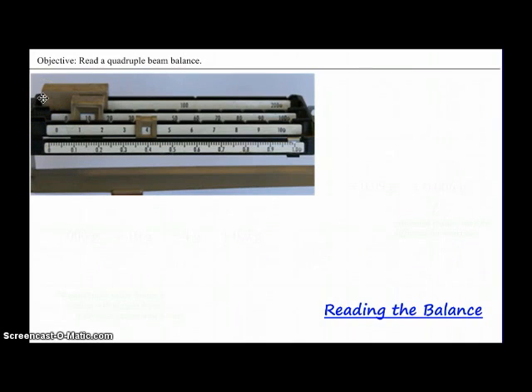When we take a look at the beam farthest away from us, that's where we're going to start. And we can see that our rider is all the way over to the left, so it's at 0 grams. That would give us a reading of 0, 0, 0 grams, or no hundreds. Our next beam here in front of that, you'll see that the rider is boxed around the 10. What that means is that it's showing a reading of 10 grams.